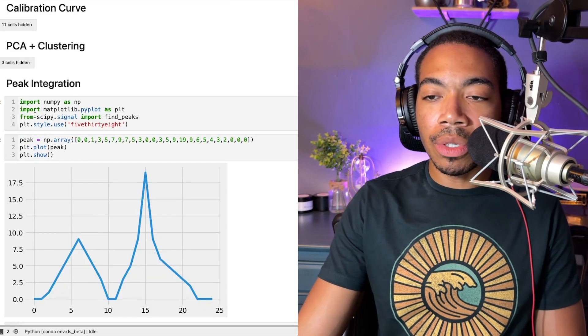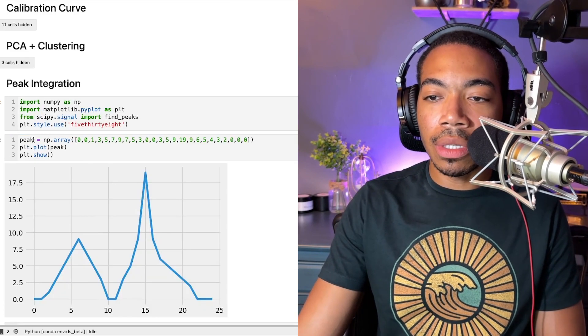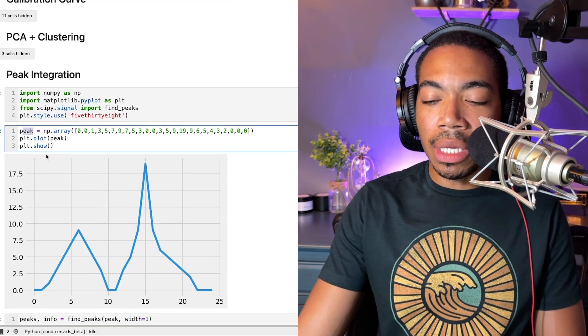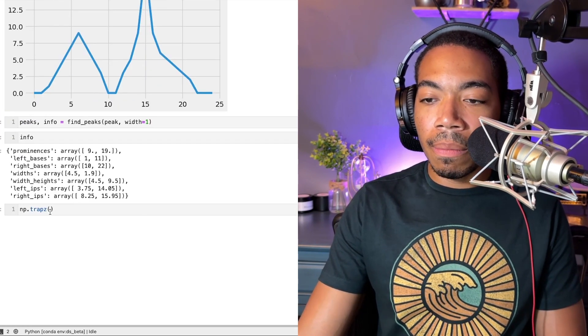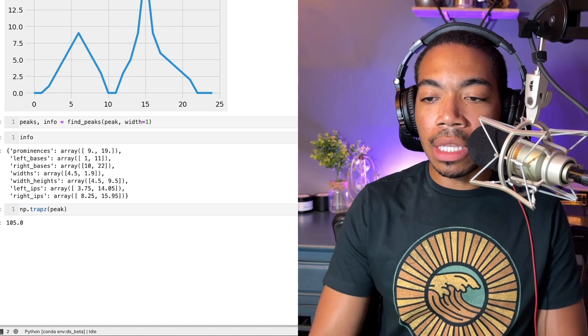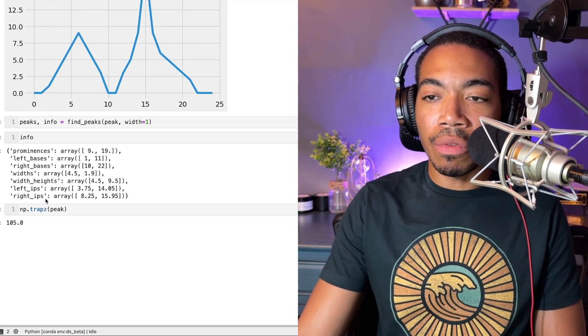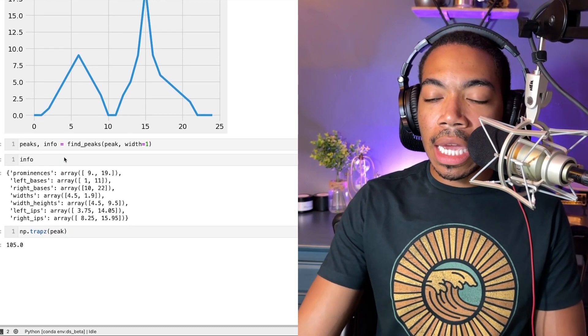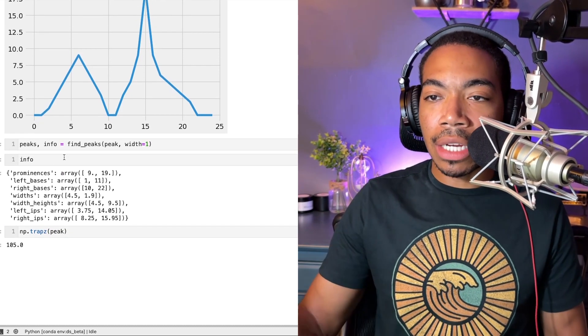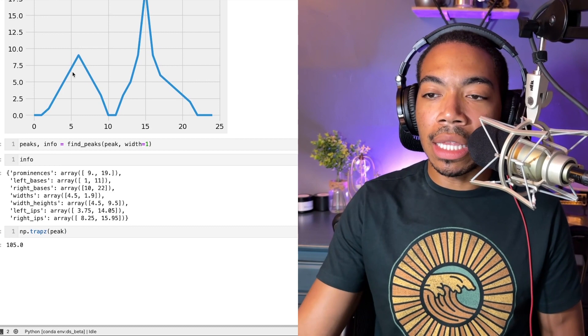This is where the information on the left and right base come in. What we'll do is take our information from peak and pass it in. You see that if we do this, we get an area of 105, and that's because we are actually now looking at the integration of this entire area.